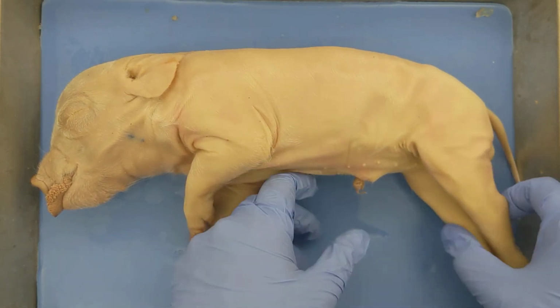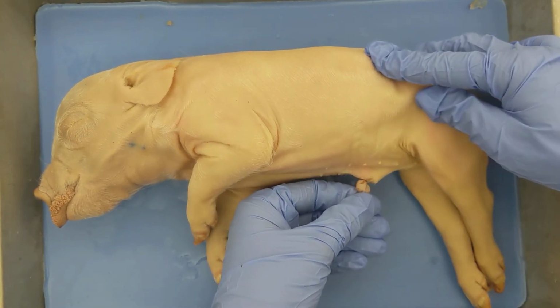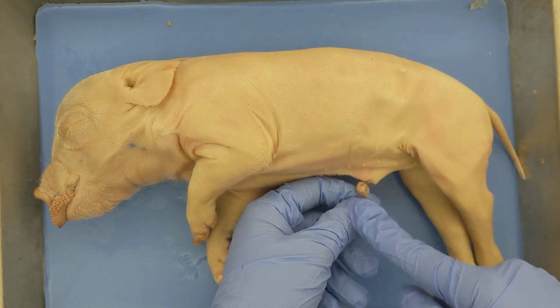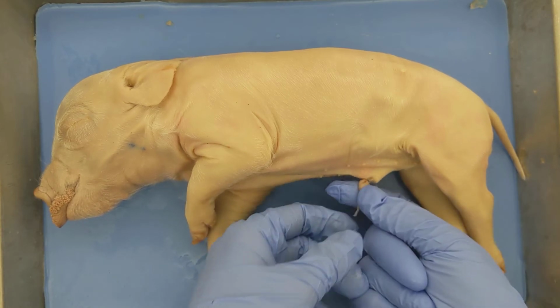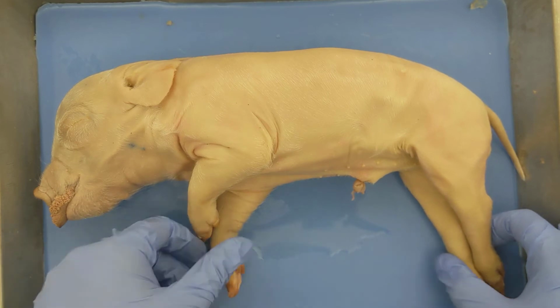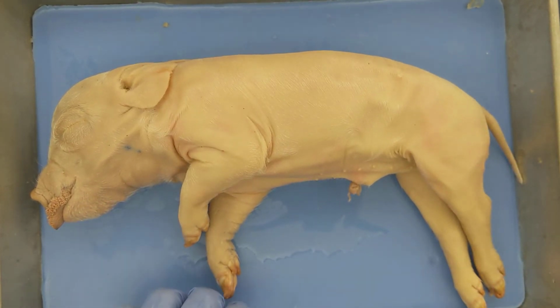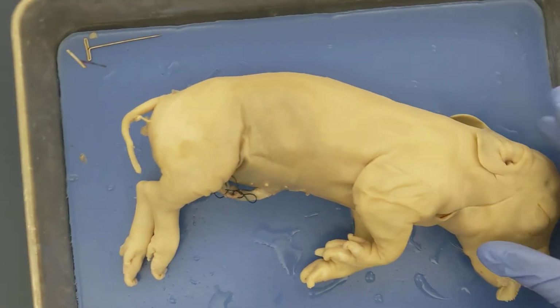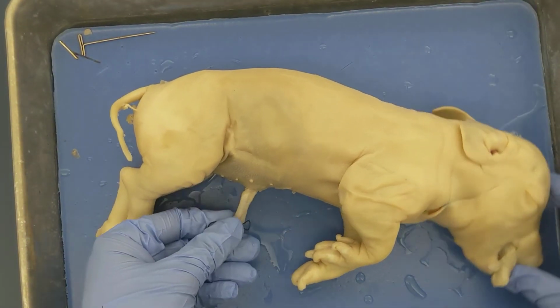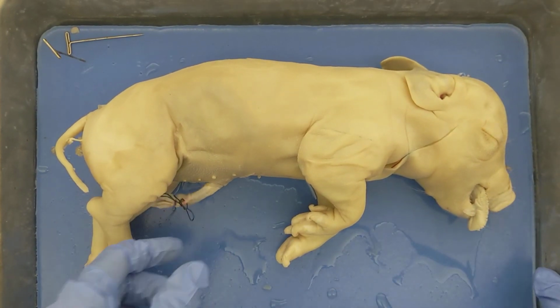Another thing you might notice on this pig, and actually this pig has a poor example of it, these are fetal pigs, so they still have an umbilical cord where they were connected to their mother. So this pig's umbilical cord is here. I'll show you another pig in a second, has a more defined umbilical cord. And of course the pigs have a tail. Let me switch this out for another pig real quick that has a more developed umbilical cord, or one that hasn't been cut so much. So here you can see the umbilical cord, all right? So those are some of the external features.